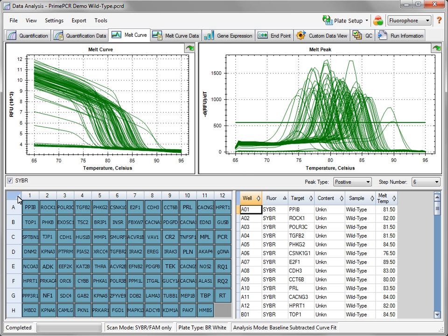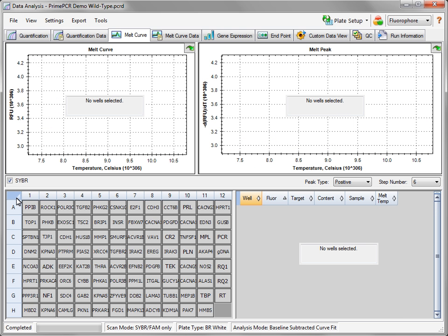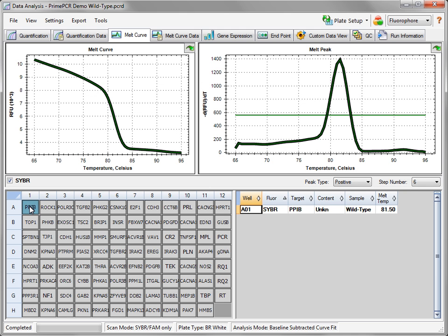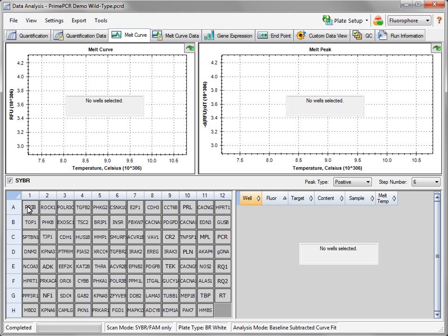To check amplification reaction specificity, click the Melt Curve tab and examine the melt curves for each target. There should be only one major peak and the melt temperature should typically be above 75 degrees Celsius.